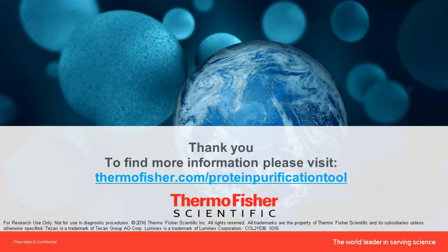Excellent. Thanks, Andreas. And our next question asks, for the IP-MS identification using streptavidin magnetic beads methods, do you do digestion of the whole complex, or do you elute the proteins from the beads? And if it is the latter case, what type of elution protocol do you use? Bhavin, is that something you can help with?